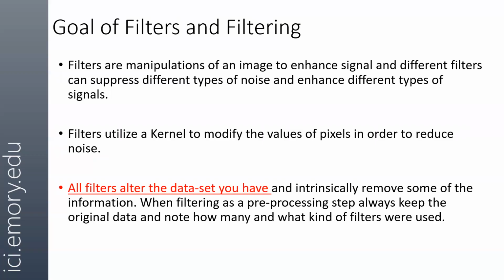For filters, as I mentioned, I'll introduce you to the theory behind them, how they actually operate behind the scenes, and then what that means later on. I'll also give you some example filters that are pretty useful and pretty widely used actually in bioimage analysis for removing noise or enhancing boundaries. And we'll see more what that means later on.